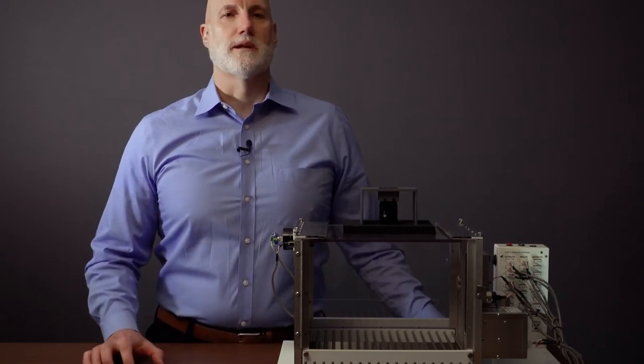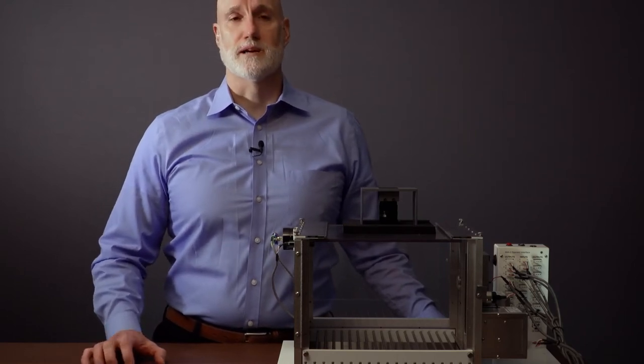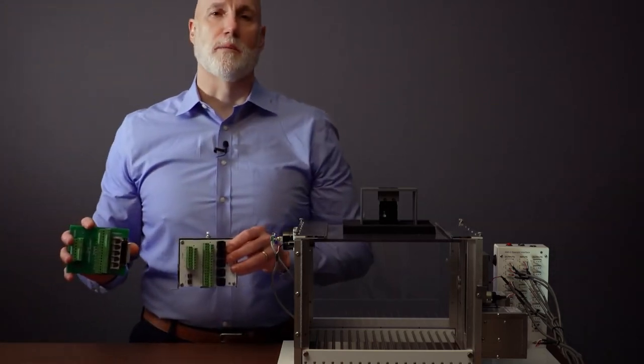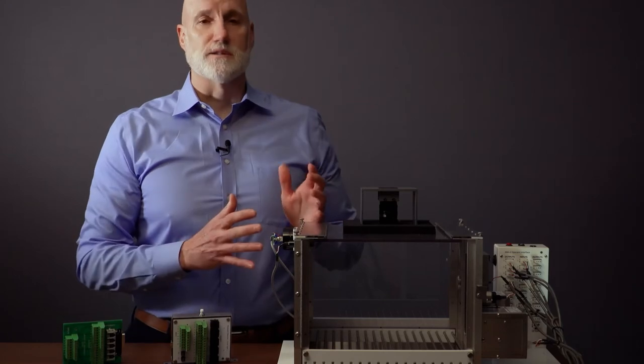If you're using Lafayette or Colborne setup, you're going to find that the components connect exactly the same way. It's the same connectors that you're using now, and so you'll just connect your components the same way. And that's it. That's the physical setup of our box.